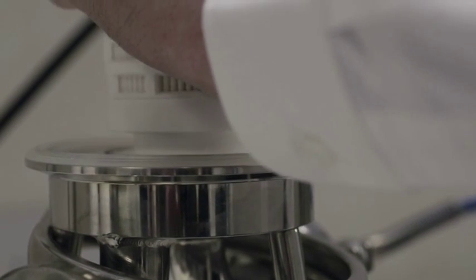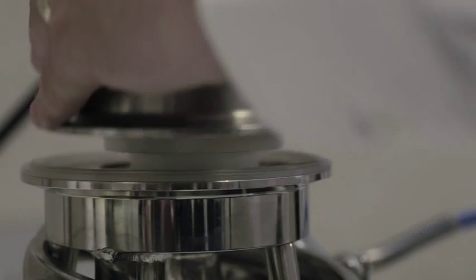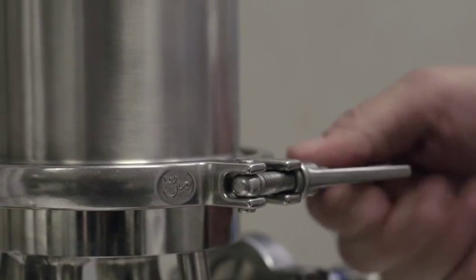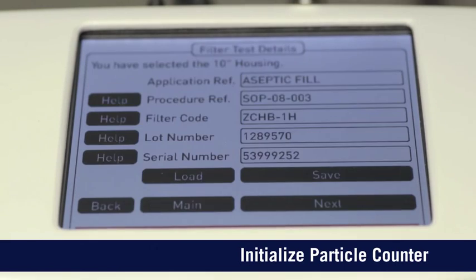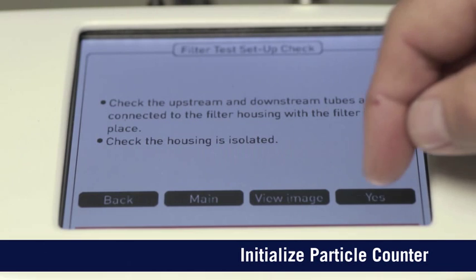The ValairData 3 comes with all the accessories needed to perform the test. The unit incorporates a touch screen facility that is easy to navigate.